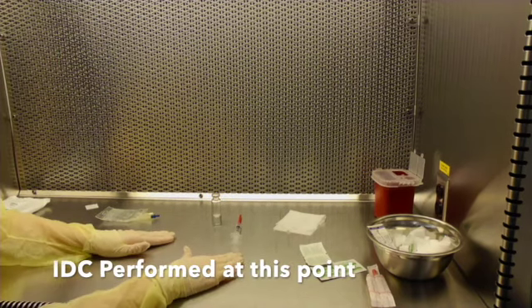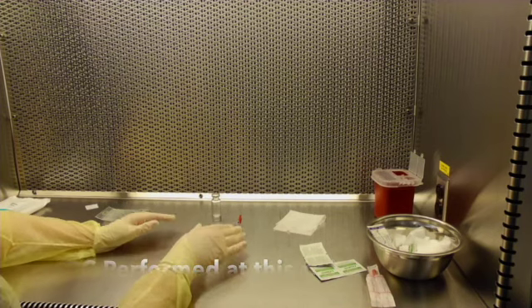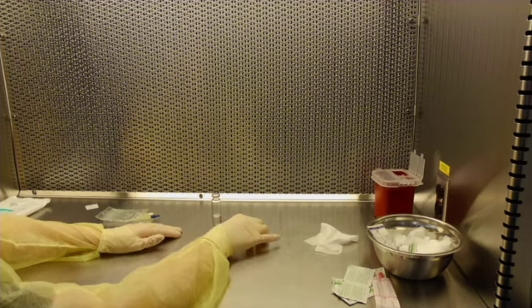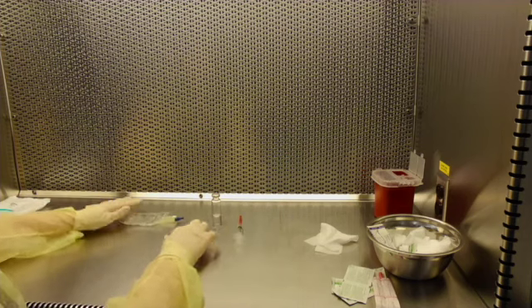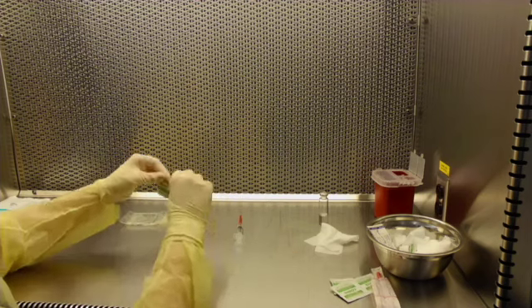It's important to always place the syringe with the drug to the right of the vial. We do this because of organizational flow within our hood. We may have more than one drug vial in our hood, so having the syringe always to the right of the vial, or the left, depending, is important.